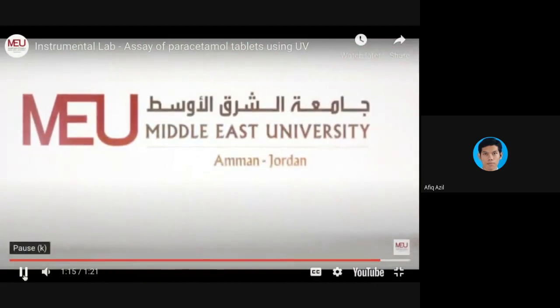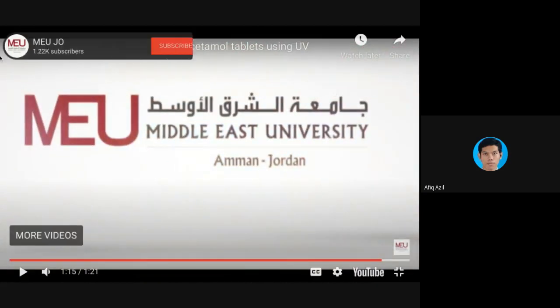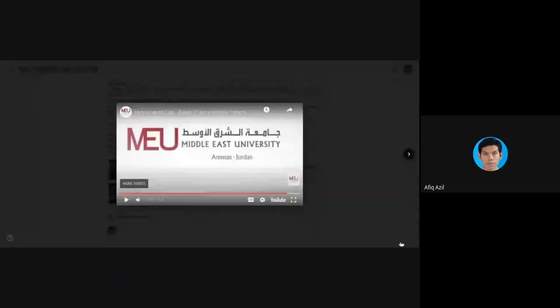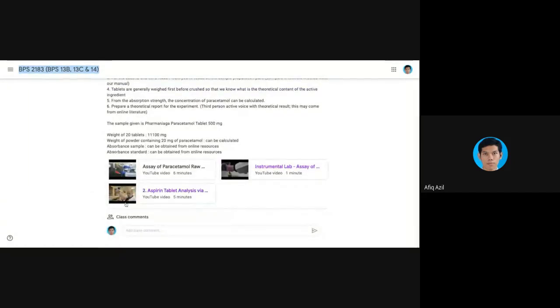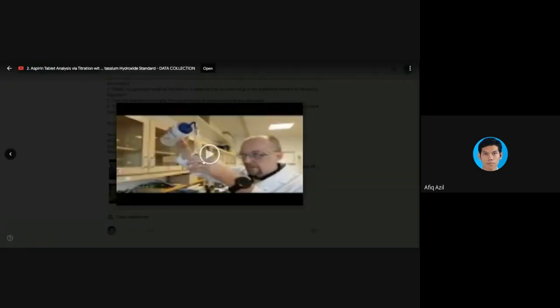Okay, so the measurement using the UV is quite simple, like what I have shown you last week. But then the sample preparation, on how you prepare the tablets, there is another video. This one is actually on aspirin tablet, but I just want you to see the methodology itself.